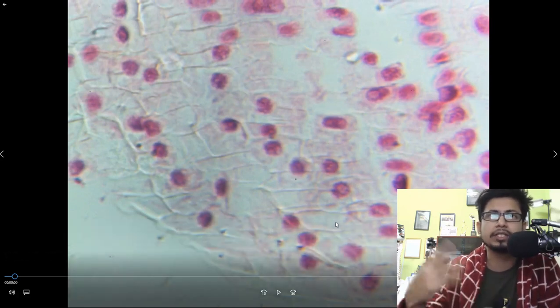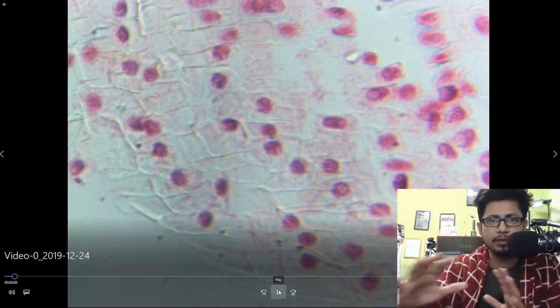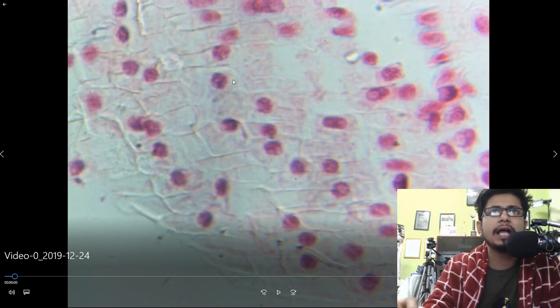Here we are going to see the onion root tip cells and mitosis ongoing in the onion root tip. The video will be fast, so I'm going to show you all the different things. If I pause it, you can see a lot of different varieties. These red spots are the nucleus, and you can clearly see how the nucleus is separated — this is a newly separating nucleus, and here the septum is forming.